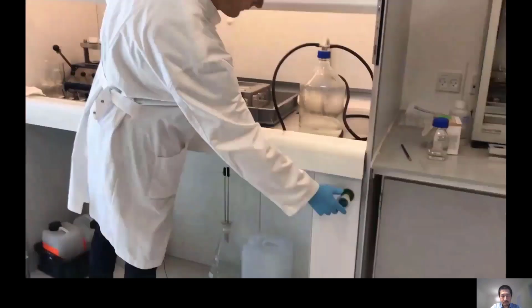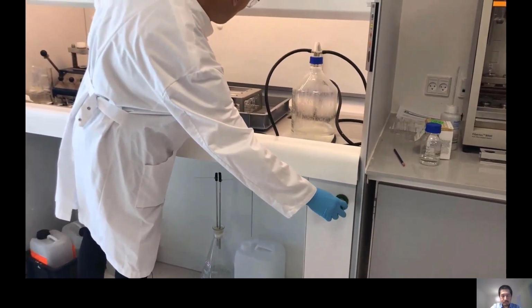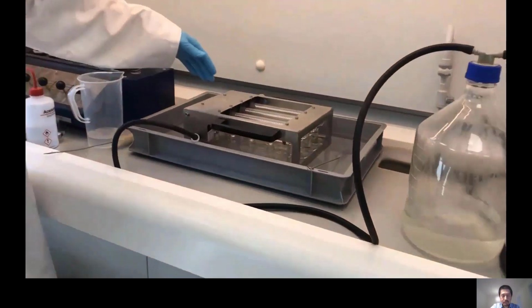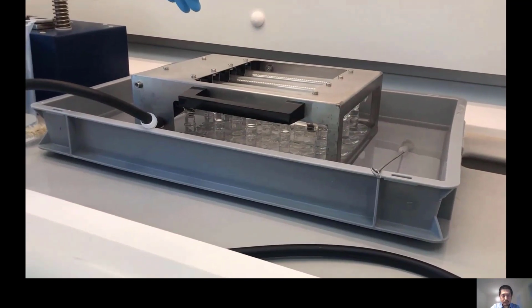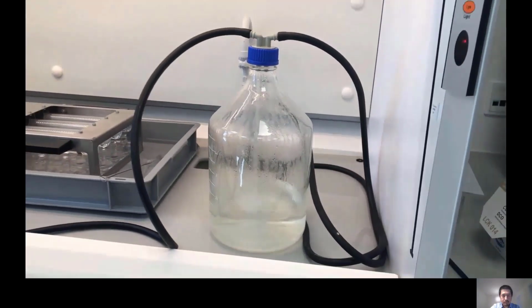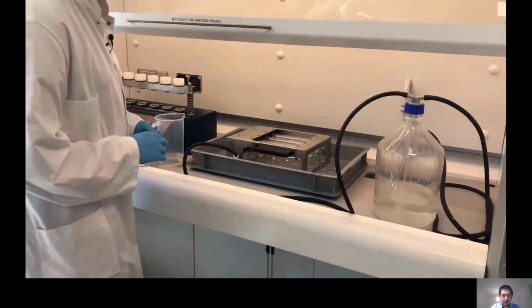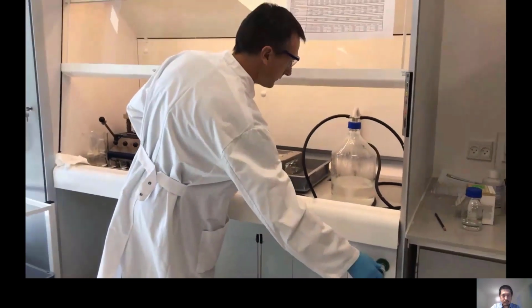and then simply just turn on the water at high speed. And then all of these 20 manifolds will be cleaned, and the waste will be collected in this flask here. So that's an effective way of removing most of the acid. When you've done that, you can turn it down.